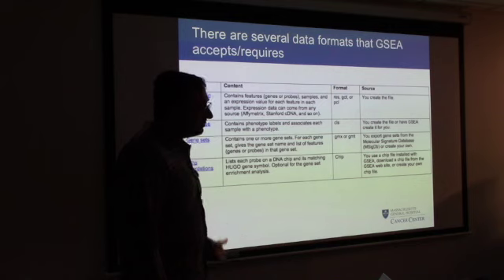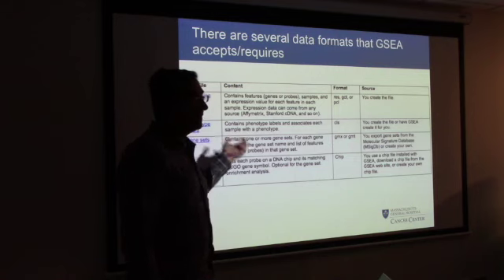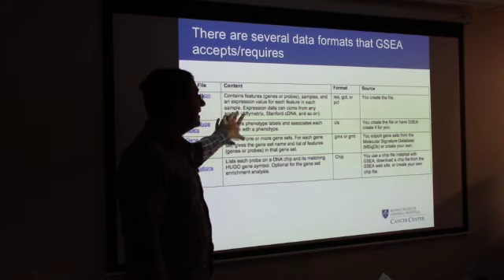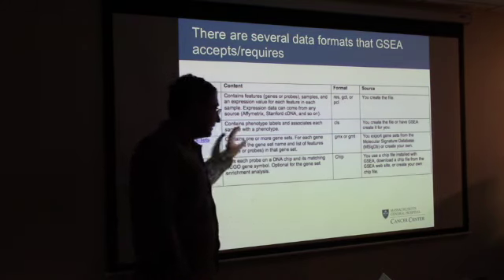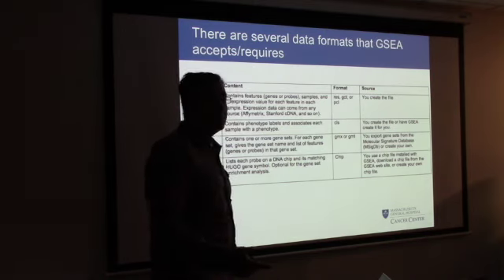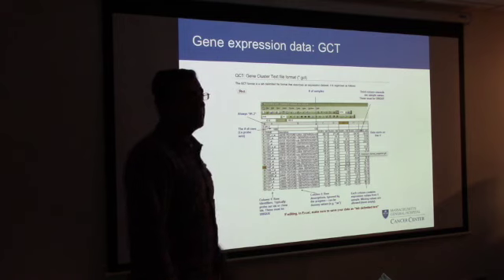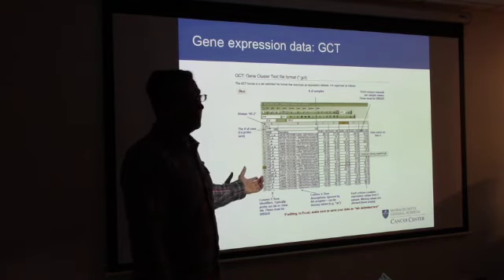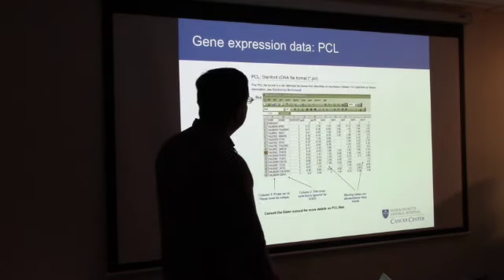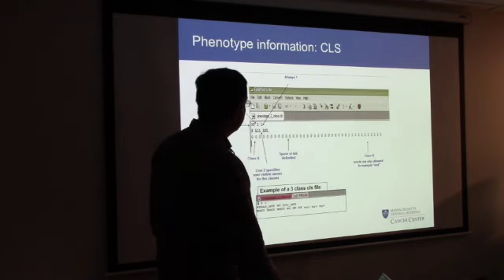if you're using microarray data, then you have to enter the expression file, and GSEA's platform will do its own differential expression for you. It also has particular formats that the file needs to be in. It's painful, but it's doable. You just have to convert your file into these formats, and if you are ever using microarray data, you can come back to this presentation, where I've listed what the formats need to be and how your files need to look. So for example, your expression file needs to look like this. And then you have other format files that need to look like this. Again, you're not doing any of this, so you're good.